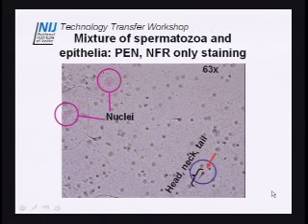But here, you can see that's a sperm head. And that would be something that would take a little more skill. You would just want to make sure that that's a sperm head that you're cutting and not a pore on the slide or something.